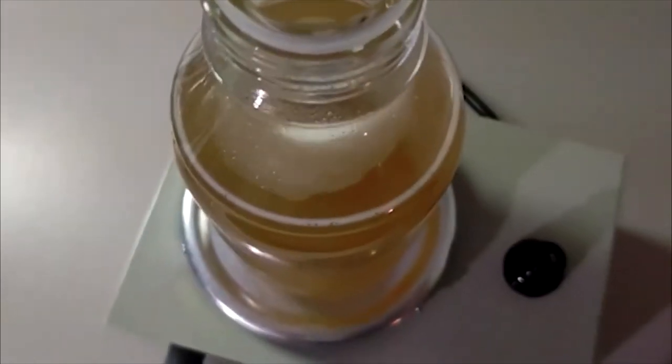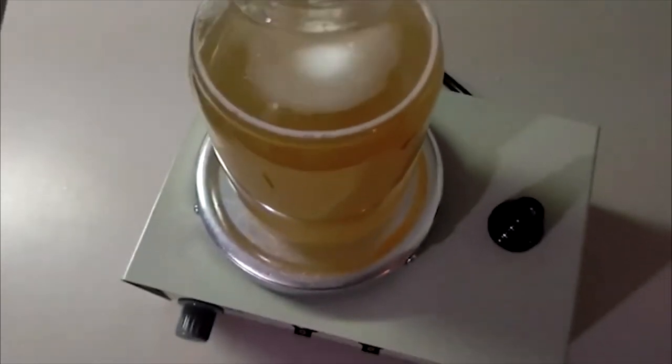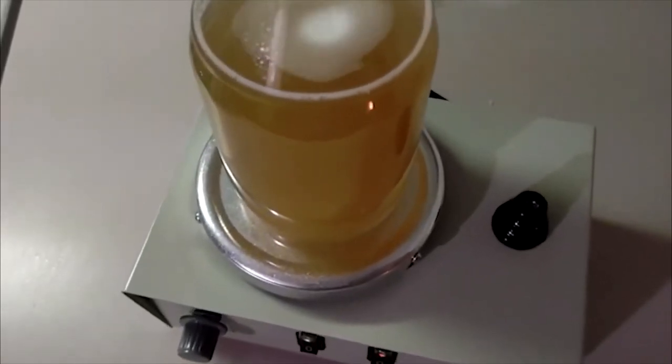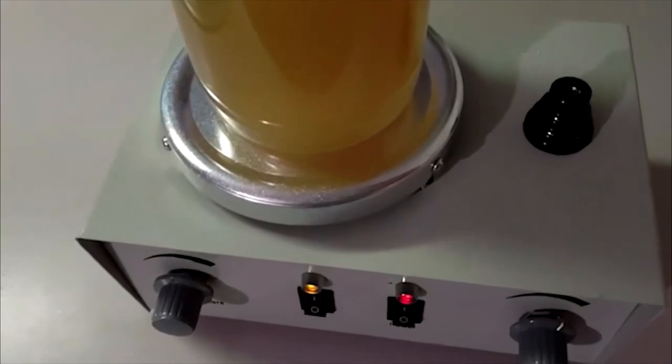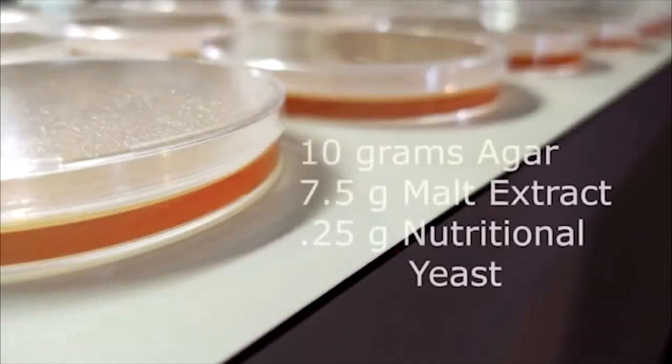When working with the nutritional yeast, even when you created a fine powder, it will leave a cloudiness to your agar and particulates. We've tried straining this out and it's still there and it's okay. We have not experienced any contamination. It's been a really positive recipe with just so much rhizomorphic growth. So the particulates and the cloudiness are just not a problem at all.